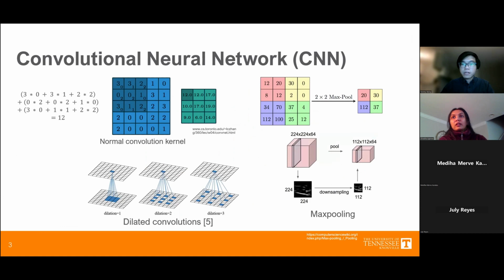Right, in any network. So one is a convolution and the other is a fully connected layer. So in UNet, we are not using a fully connected layer, right? Then if we are not using a fully connected layer, how is the probability getting calculated?